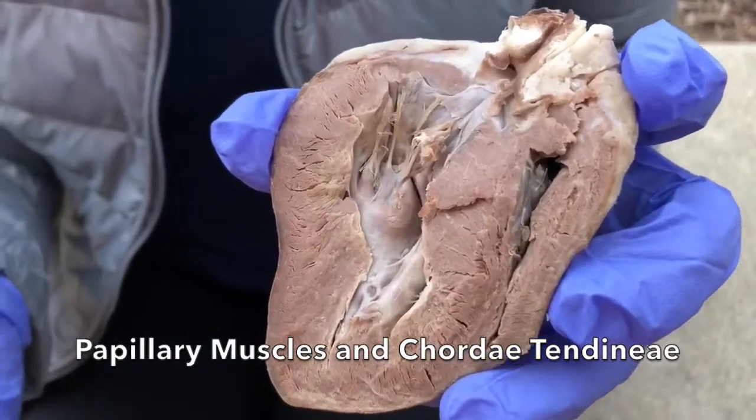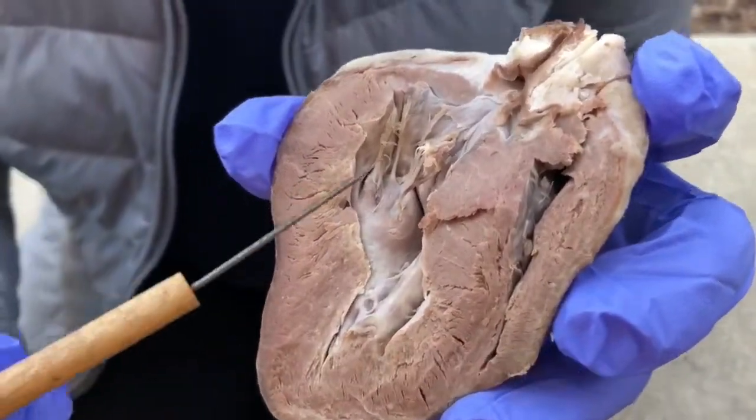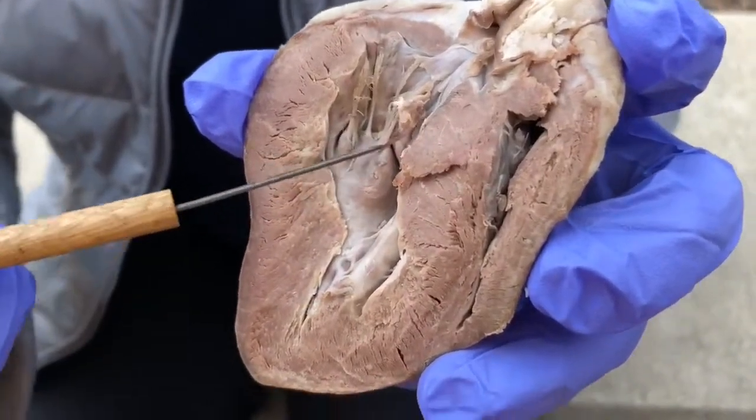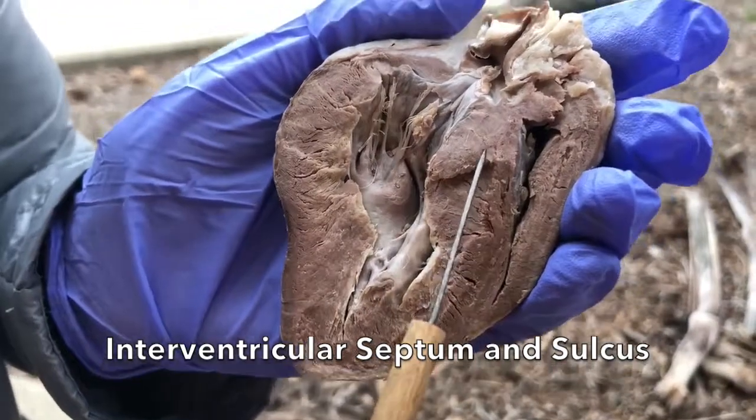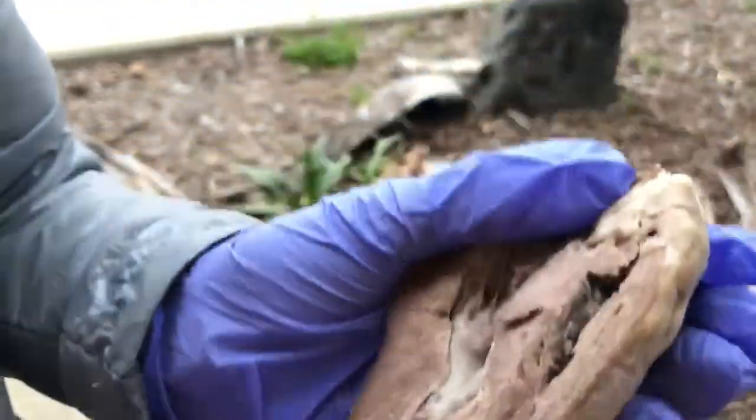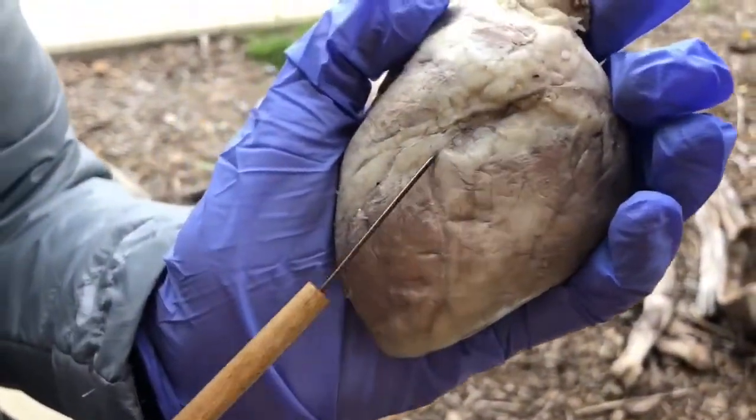Hi, it's Felicia, and here I have the anterior side of the heart. Here we have the papillary muscles, which are connected to the chordae tendineae. Continuing with the anterior side of the heart, here we have the interventricular septum, and on this side we have the interventricular sulcus.